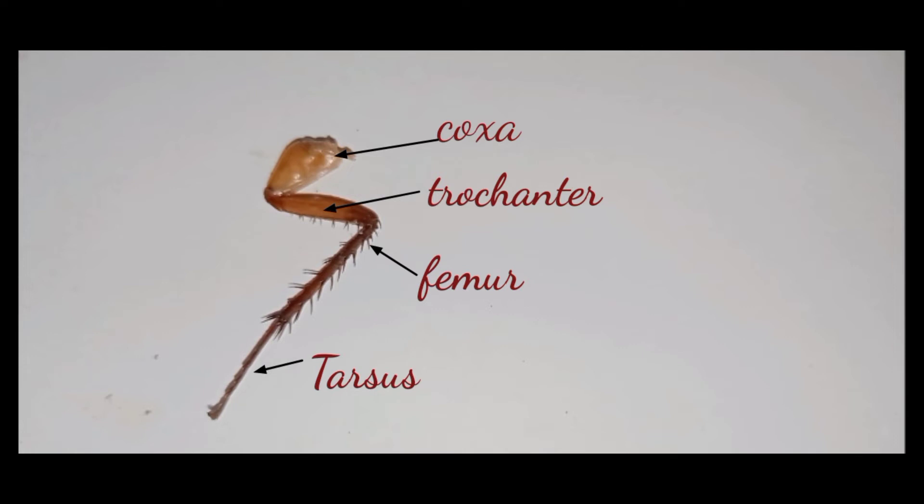And lastly, the tarsus. It acts like an ankle or foot that helps the cockroach to climb walls or walk upside down the ceiling.